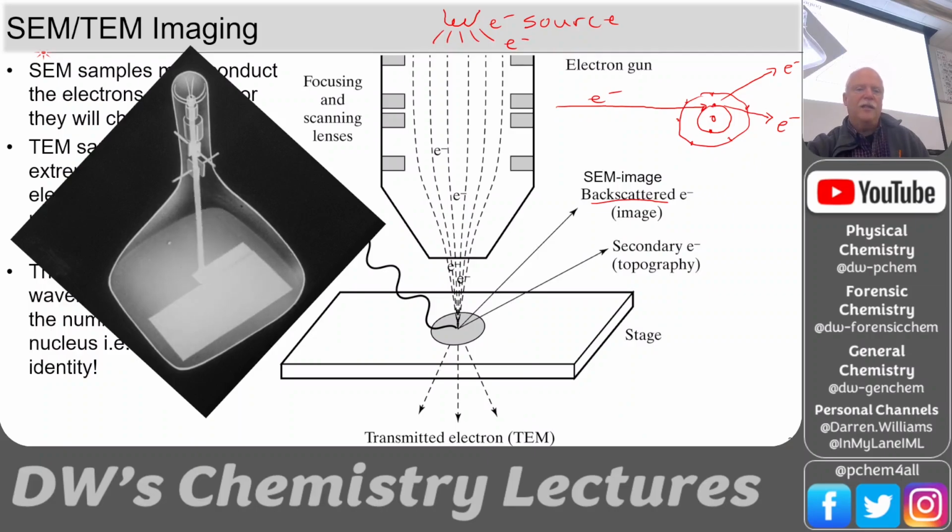Now, if we raster this across the surface, y'all haven't seen these old TVs, have you? These cathode ray tubes, you know, your grandparents' TV, the one I grew up with. It's actually scanning an electron beam at that glass that displays the image.